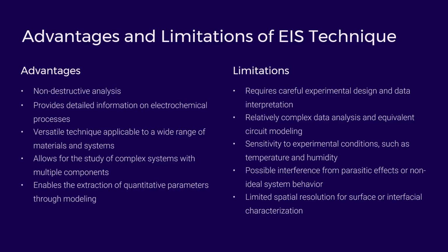And what are the limitations? It requires careful experiment design and data interpretation, relatively complex data analysis and equivalent circuit modeling. It is sensitive to experimental conditions such as temperature and humidity, possible interference from artifacts, effects of non-ideal system behavior, and limited spatial resolution for surface or interfacial characterization.